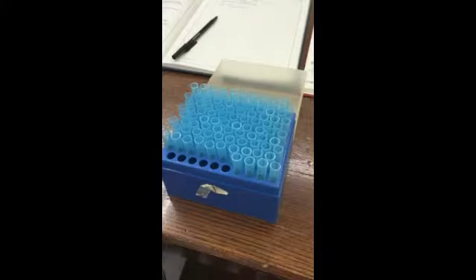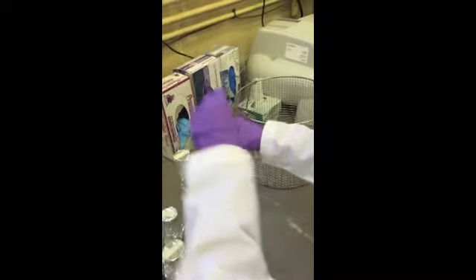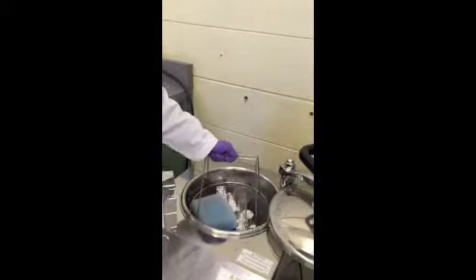Since E. coli is a biological hazard, all work possible should be done in the biosafety cabinet. Even gloved hands should be sprayed with ethanol before using the biosafety cabinet to avoid contamination. All glassware and other equipment used for this experiment was washed thoroughly with soap and water. After cleaning, all openings were covered with aluminum foil and heat-sensitive tape was placed on each item. All pieces were then put in the autoclave to be sterilized.